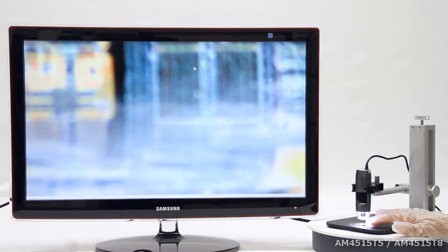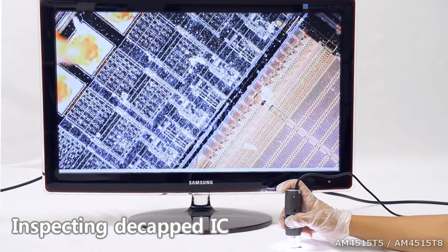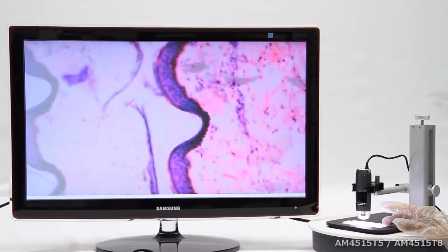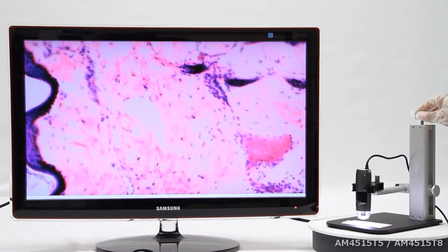The AM4515 T5 has a magnification range of 500 to 550 times. The AM4515 T8 has 700 to 900 times power for the highest range offered in Dynalight handheld microscopes.